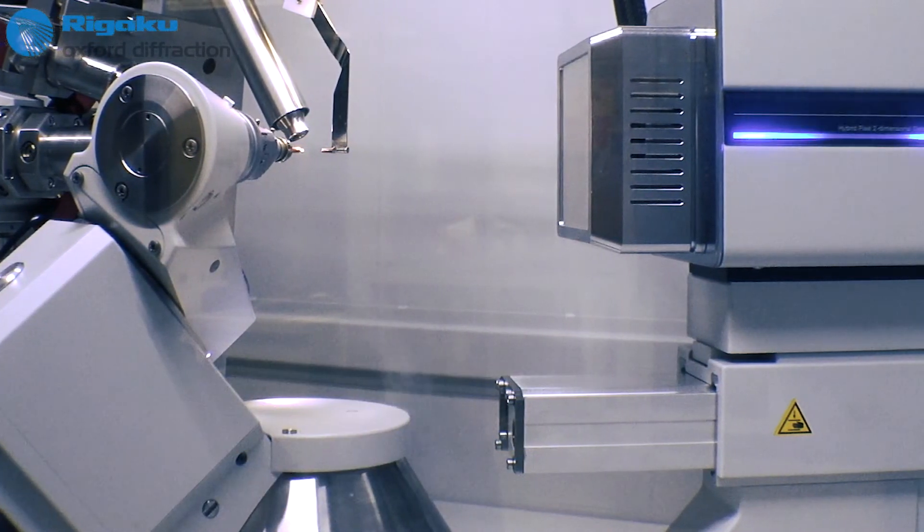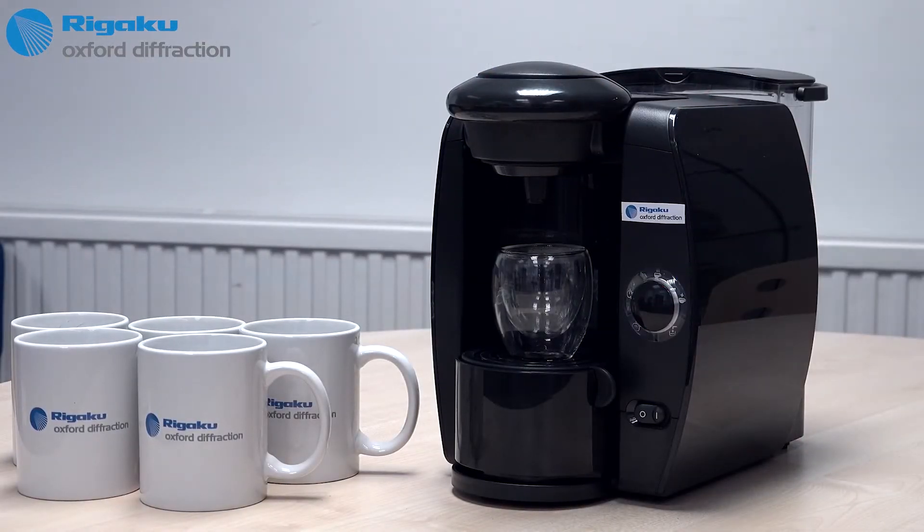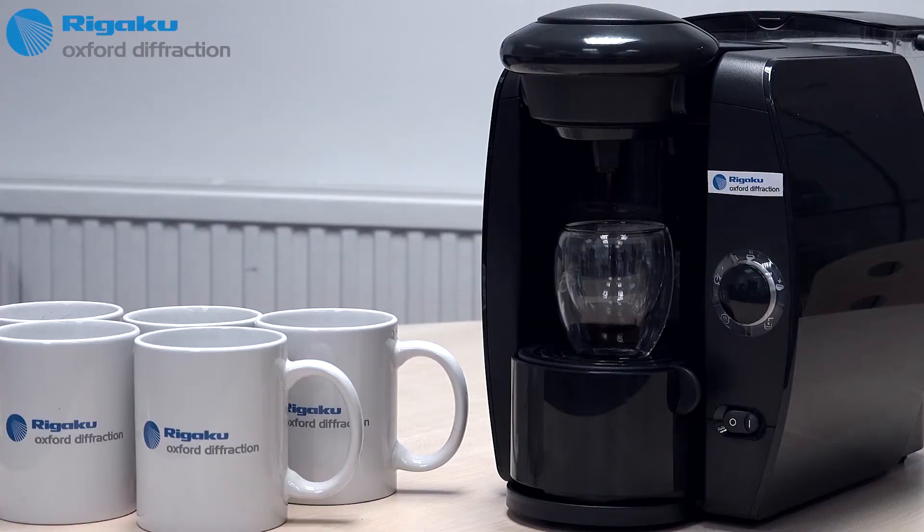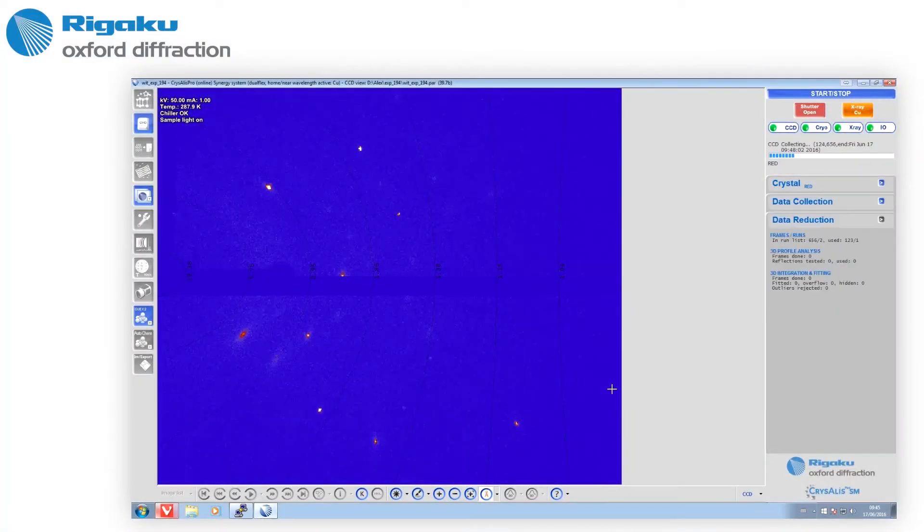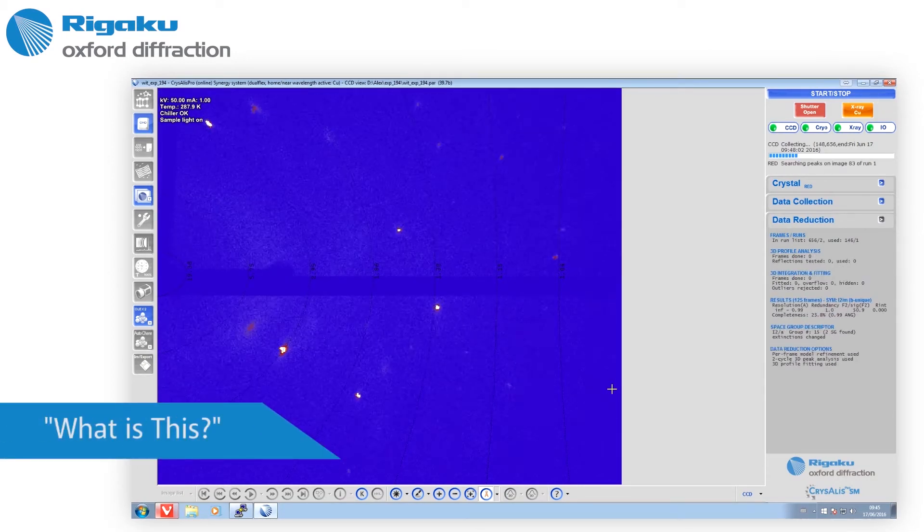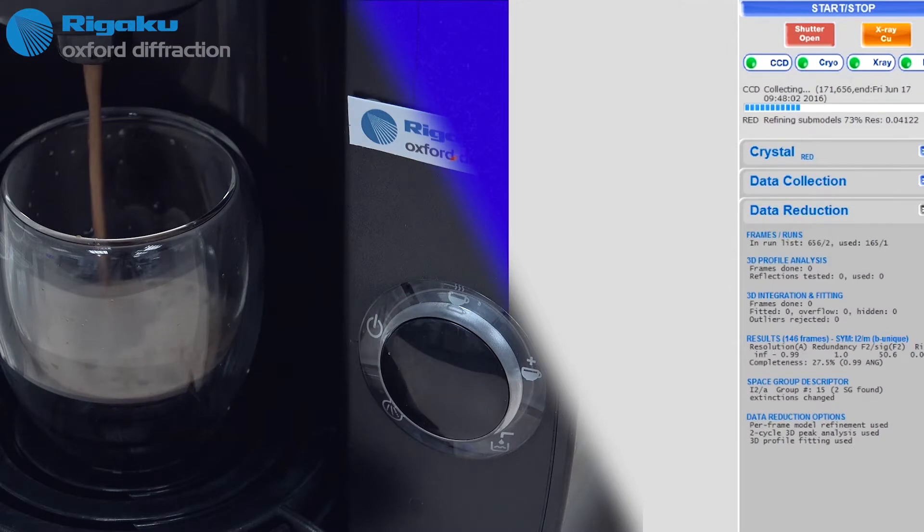In the not too distant past, crystallographers would often drink a cup of coffee as they waited for their diffractometer to evaluate a new crystal. With the new Crystal Lab Synergy diffractometer incorporating the revolutionary What Is This feature, you can actually collect your data, solve and refine your structure before you can even make a cup of coffee.